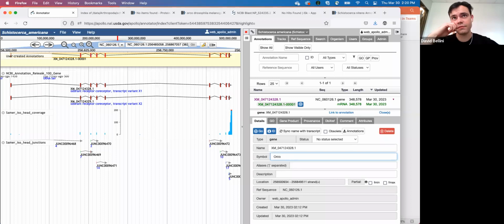I've encountered a lot of strong marker genes that just don't have any homology to any known species, even after I tried blasting them. Yeah, you'll find a lot of those. Attributing a name to it really depends on the function, I think, and unless we actually know the function of that particular gene, all the names that we have are somebody's dissertation project.